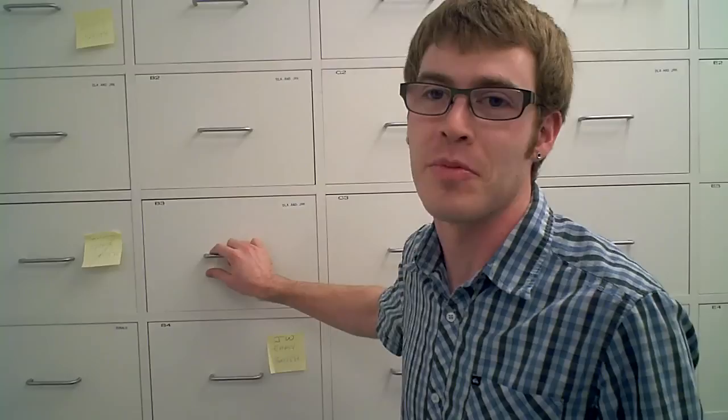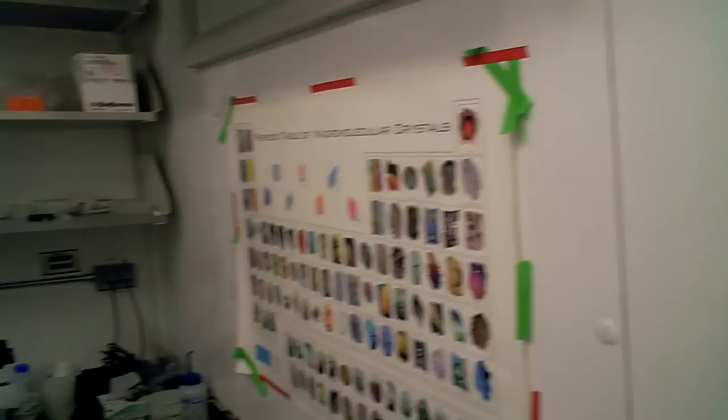This is our climate controlled crystallization room where we store our crystallization experiments. Each member of the laboratory has a cubby where they hold their crystallization experiments. The room is climate controlled and the humidity is controlled as well. We can examine our crystallization experiments with microscopes over here.